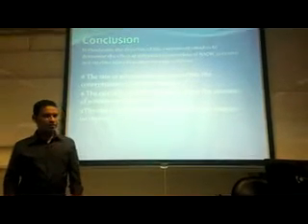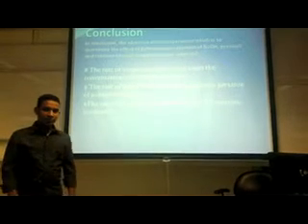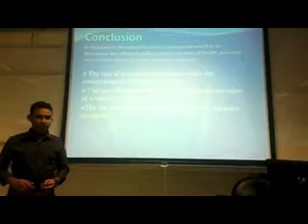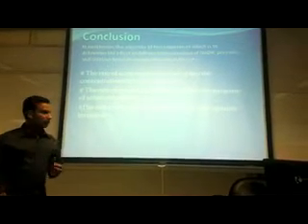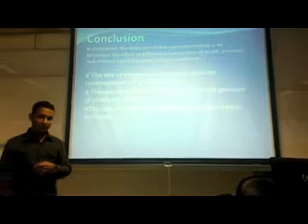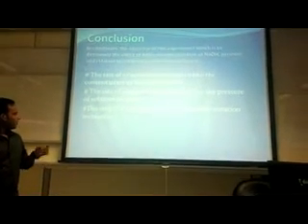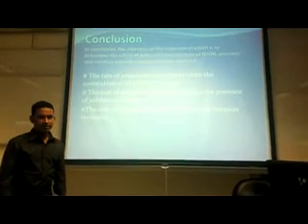So in conclusion, we found that the rate of evaporation increases as the concentration decreases. The second one, we found that the rate of evaporation decreases when the pressure of the solution increases. The third one, the last one, we found that the rate of evaporation increases when the rotation decreases.